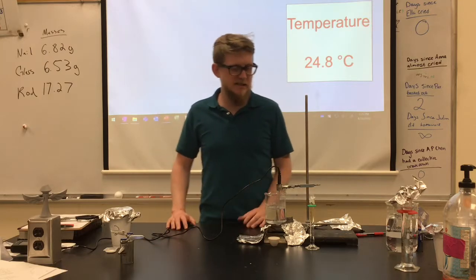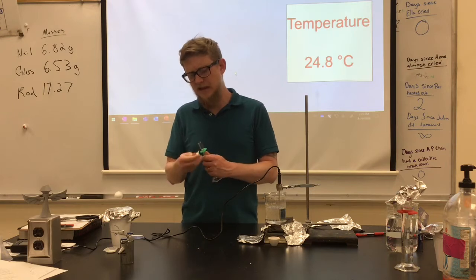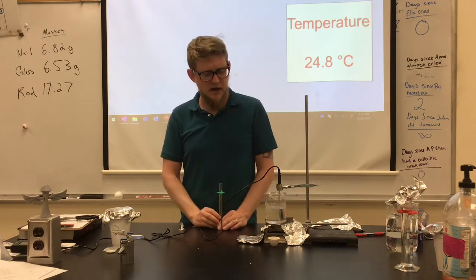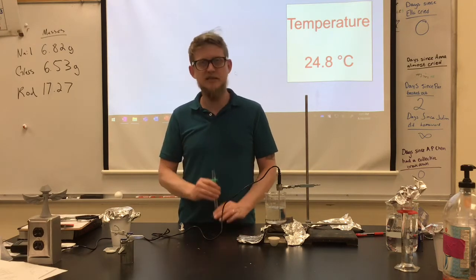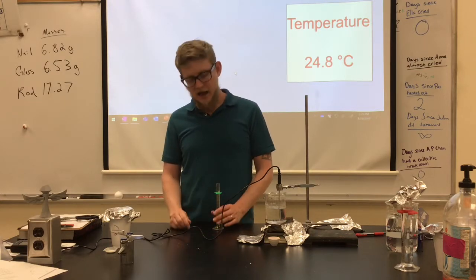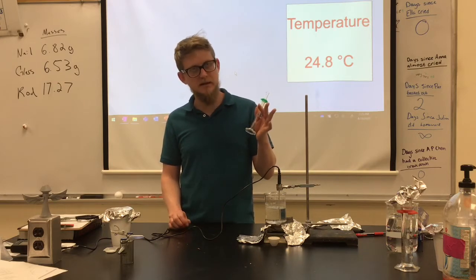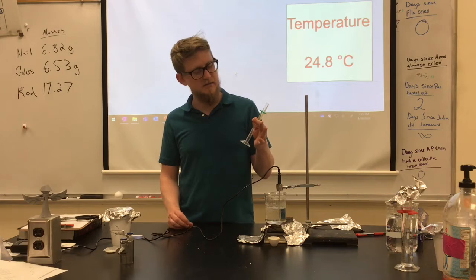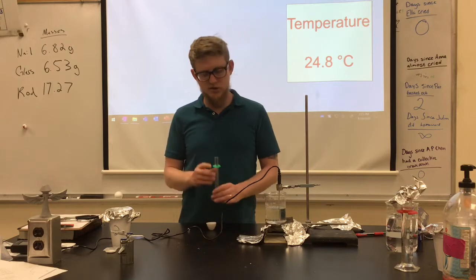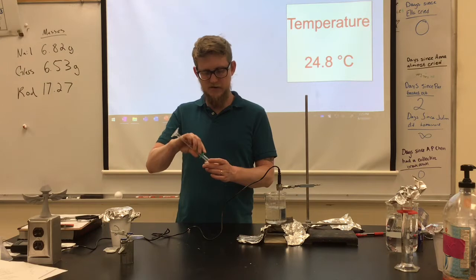The first one we're going to do is the heat of combustion. You did the calculations for this in a pre-lab already, where you took 2 milliliters, which we've measured here, of different alcohols. The one that we have today is methanol, and you calculated using the heat of combustion how many joules of energy can be released from burning this 2 milliliters of methanol. We spent a lot of time doing that in the pre-lab. All right, today we're going to release that energy, and we're going to try and funnel the energy into an object that we can measure the temperature of, okay?